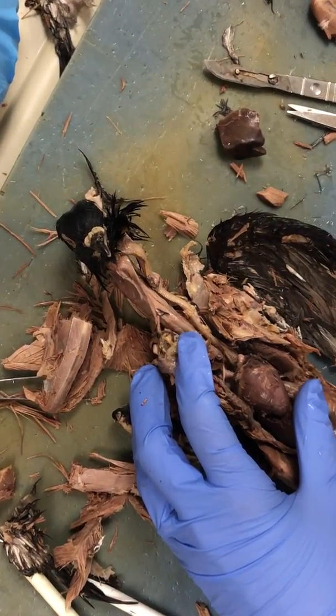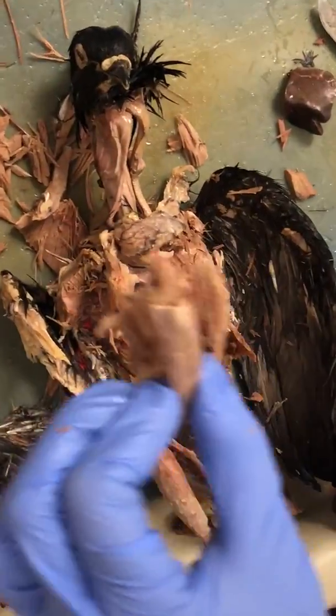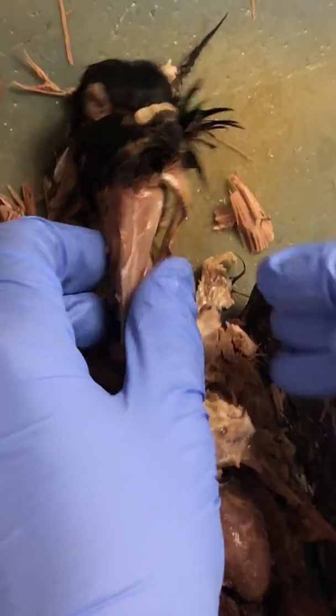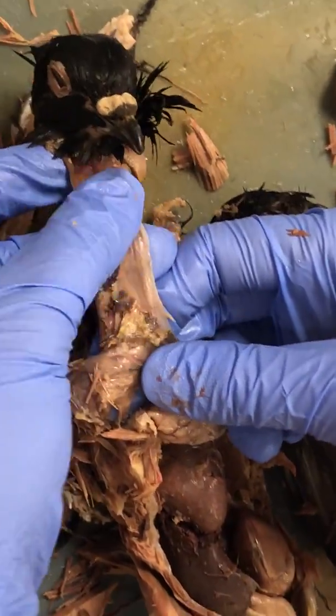Right now we're going to be dissecting a pigeon — the pigeon's already dissected and we're going to go over some of the parts. We've removed the sternum and the pectoral muscles. What we've done is opened up the bird's neck region and exposed this first part, which is going to be the esophagus.